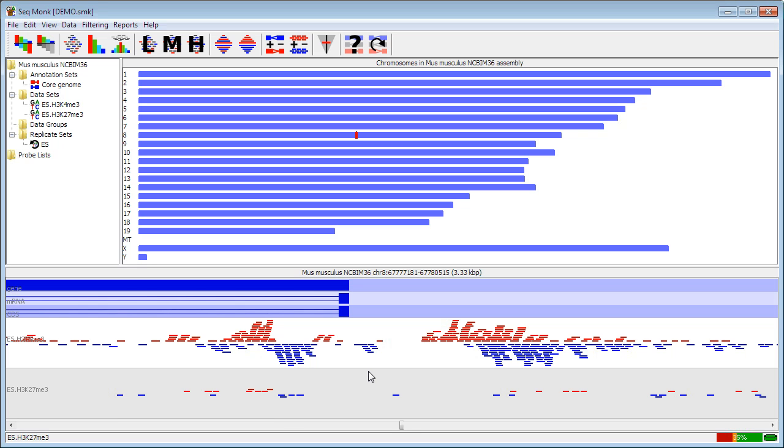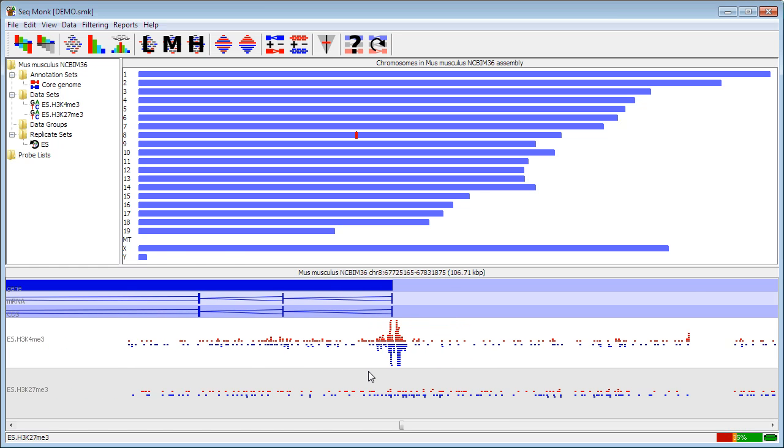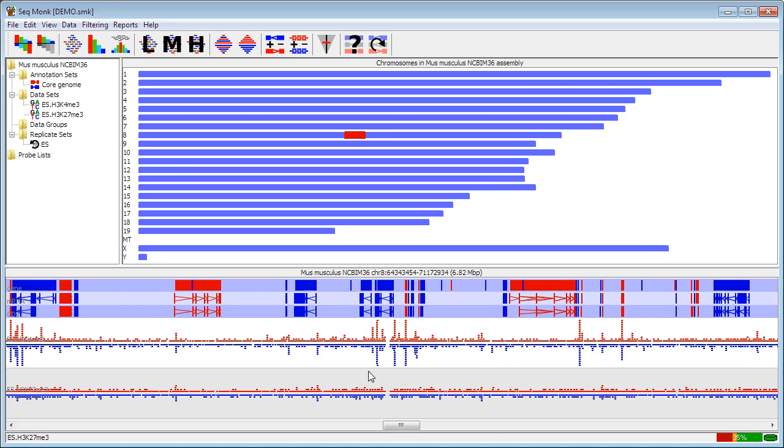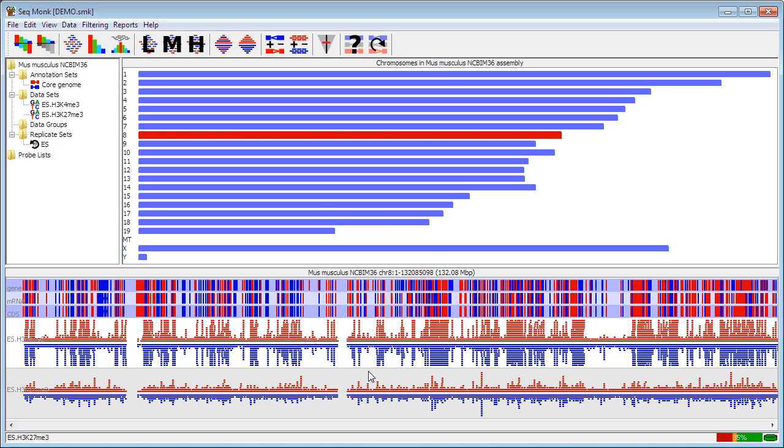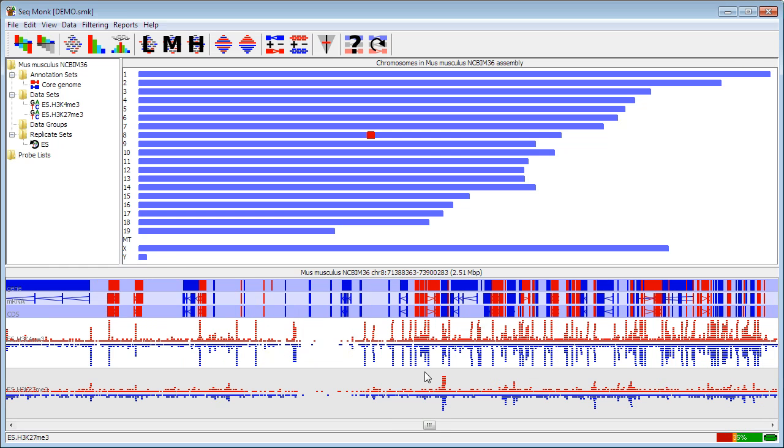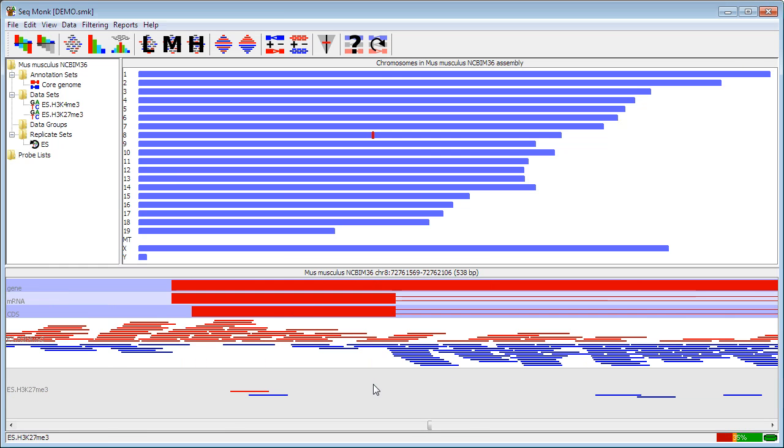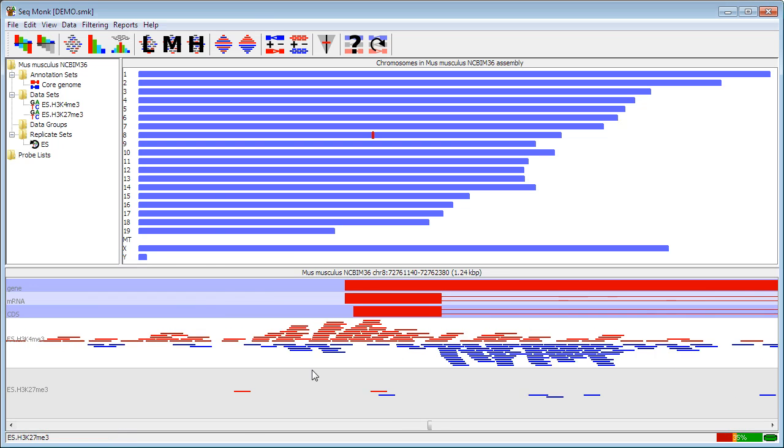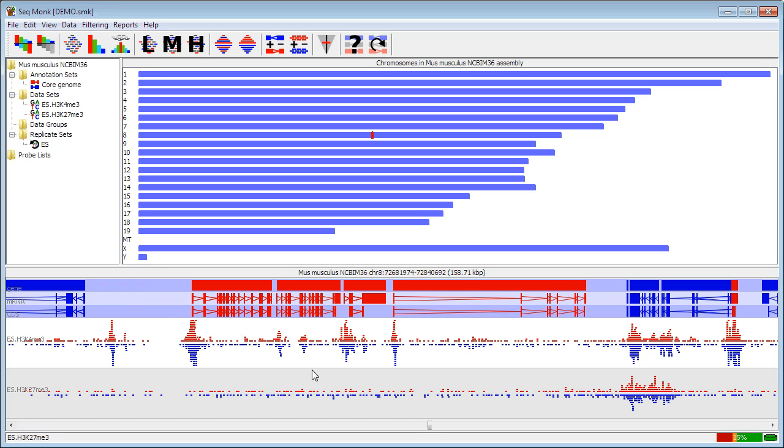To move back out you press the right mouse button or you do an apple and click if you're on a Mac and then you can zoom out. And by doing this it's very quick to step from viewing an entire chromosome to going in to looking at individual bases of individual reads. So fairly flexible system for moving in and out of your data.